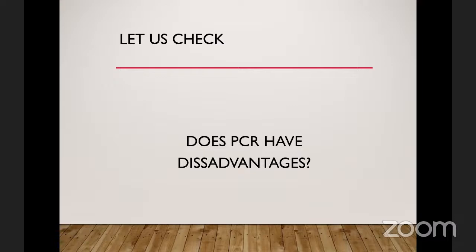And for the fact that most of these things we are saying are not cheap, the equipment, the training that is required for people to run this experiment is actually not cheap. It is very expensive to carry out, and then it is highly sensitive. So the oversensitivity sometimes can also be a disadvantage.